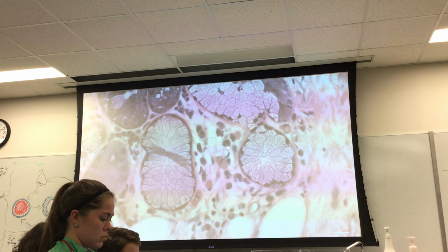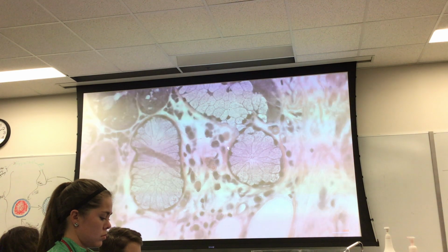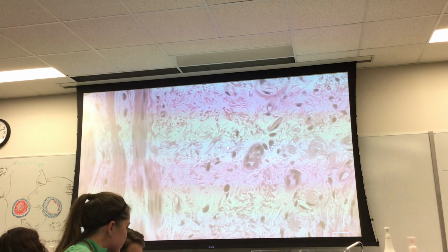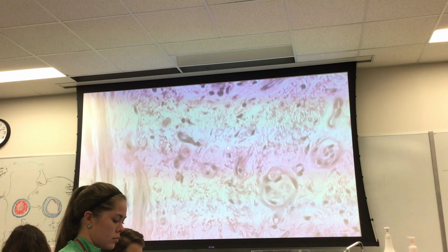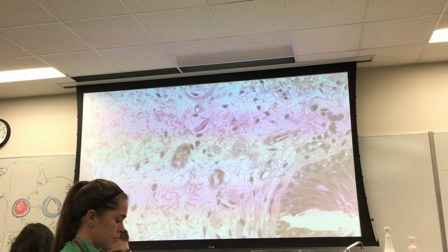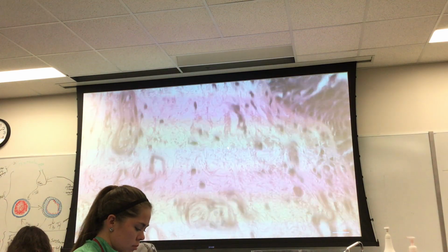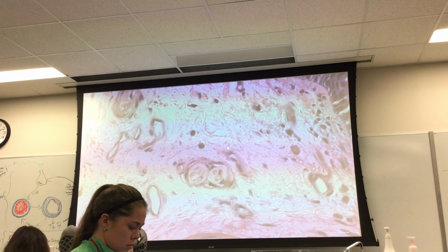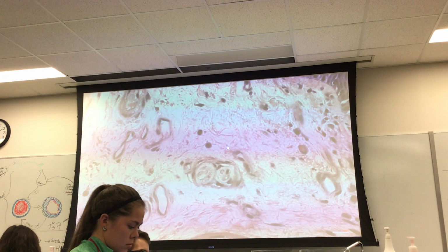A mast cell, remember, is the one that kind of has a red granular type cytoplasm. So if we came over here, for example, again, if we're going to ask you a question like this, we'll go to higher magnification for sure. Well, I'm not sure we're going to find one, but bear with me for a second.